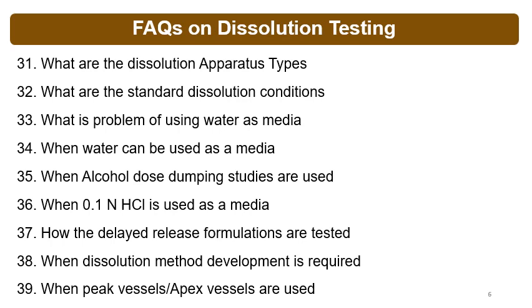When is dissolution method development required? The answer is that dissolution method development is required for all products and all types. Whenever you are working on a new or generic formulation, method development is a must. In-house dissolution parameters and method are given when there is no monograph available. But always remember, if a monograph is available, you still have to prove the discriminatory power and you have to submit the development report.